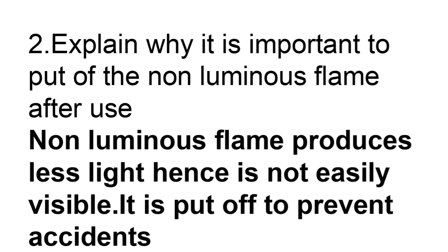Question number 2. Explain why it is important to put off the non-luminous flame after use. Here we talked about the non-luminous flame producing very little light. So that makes it invisible. You may not be able to see it.